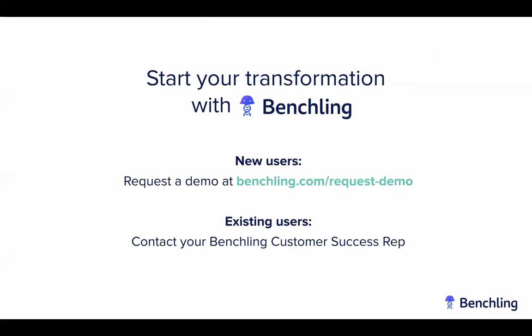Let's see. Yeah, I saw one that said, can we build our own cloning workflows? It's actually an excellent question and something that our users do quite frequently. Oftentimes they'll create a cloning protocol or standardized experimental protocol in Benchling's lab notebook, and then use the bulk assembly tool to actually clone their vectors.